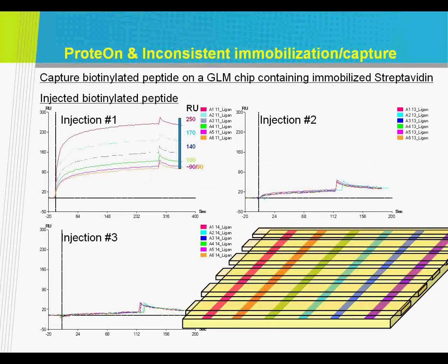We've developed a method that is fairly straightforward, but allows you to deal with that issue fairly quickly. So what you've got here is a differentially immobilized ligand. Therefore, if you want to do a bunch of kinetics, you cannot relate each of these spots to having the same Rmax, the same maximal binding capacity.